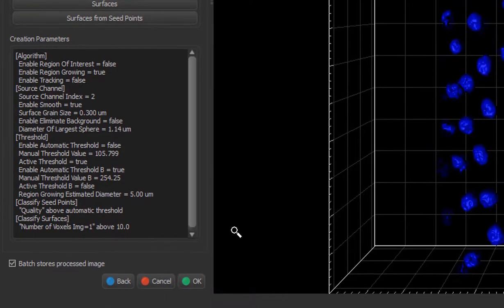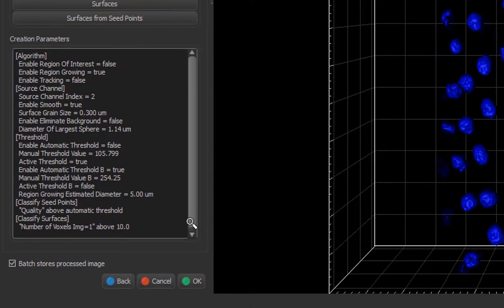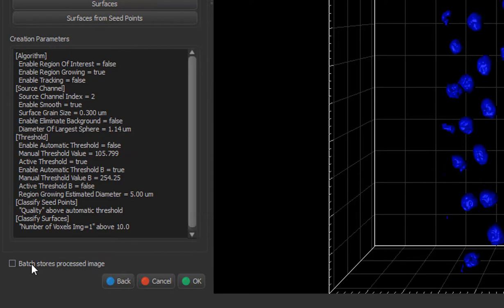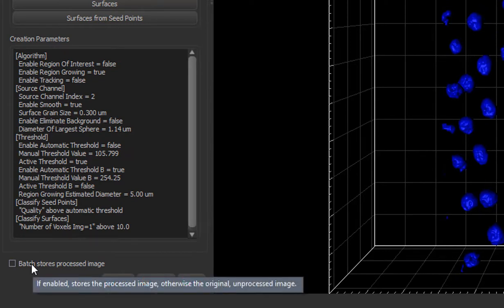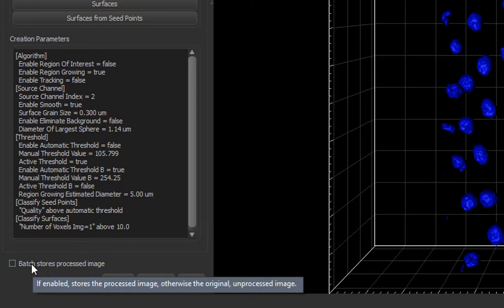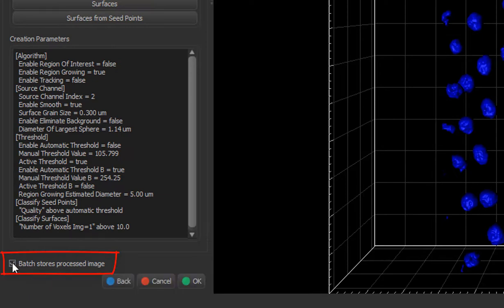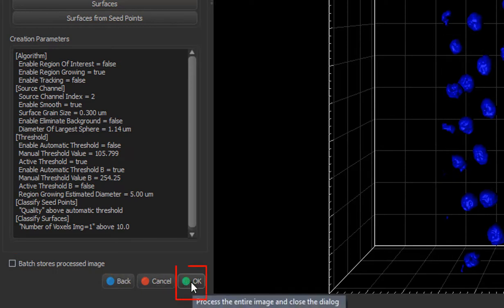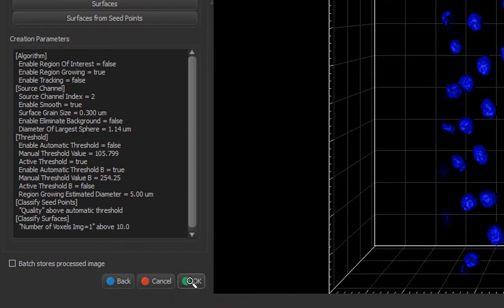In this step, it's crucial to decide if you want to keep image preprocessing results or just detect the objects on the processed image but keep the original data. If the Batch Pipeline consists of two steps, image processing and objects, the image preprocessing is not stored by default. If you want to save a processed image, you must tick the checkbox Batch Stores Processed Image. If you are ready, press OK button in the bottom, which finishes the Batch creation wizard.